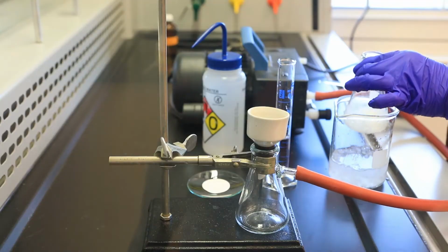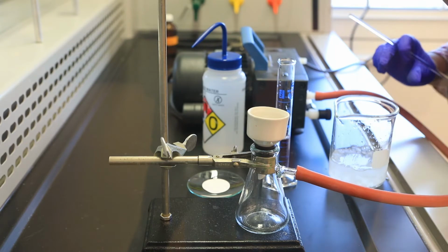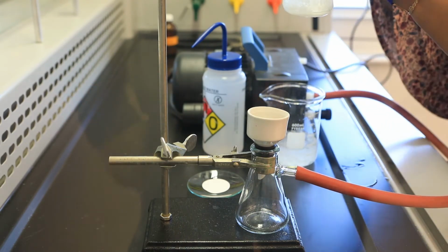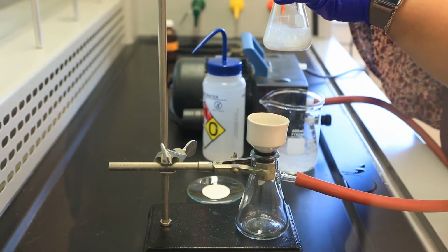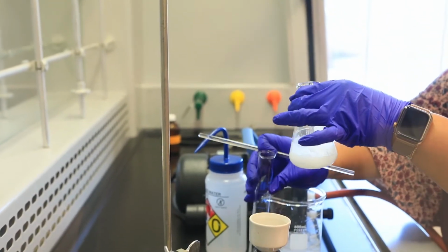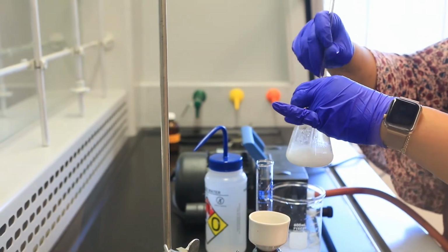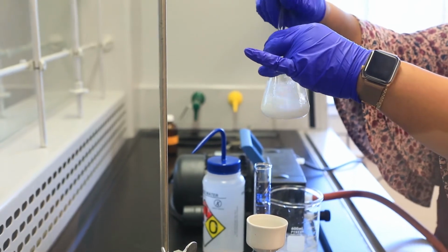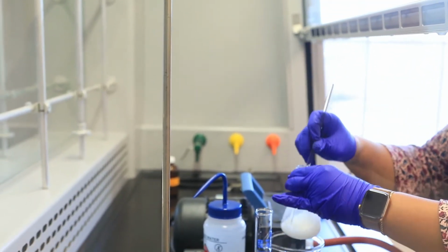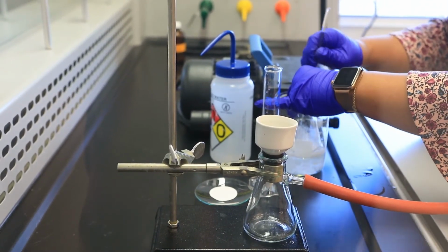So now that the aspirin has crystallized, I'm going to go ahead and add our 25 mL of chilled water, this is already chilled water. The purpose of this is just to break up our aspirin so that I can then separate it using vacuum filtration. It's already cold, but I'm still going to let it sit here in this cool bath just to make sure I get perfect crystals at the end.